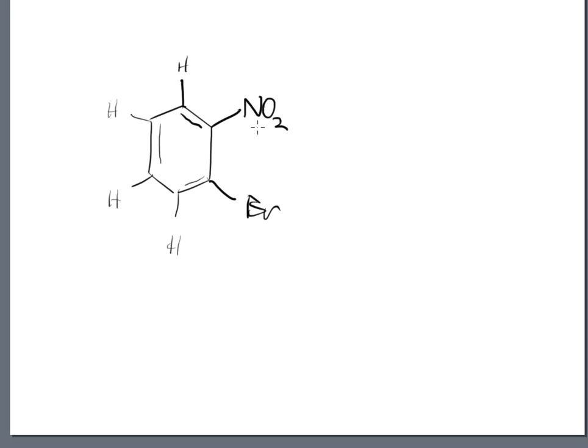So the question is, how many shifts do we have? And then describe the multiplicity in them. And if there is something like a doublet of doublets, which is something very specific now that we can look for, then we want to go ahead and mention that as well. So the first thing that we're going to do, like in all of the other examples, is guess what? Ding dong! We're going to go through and ding dong the molecule.